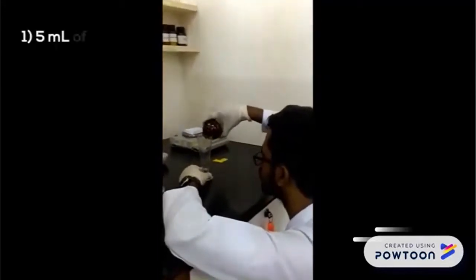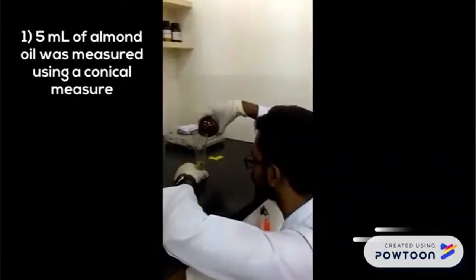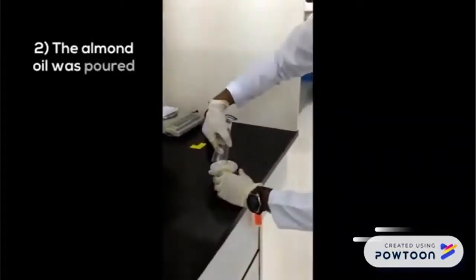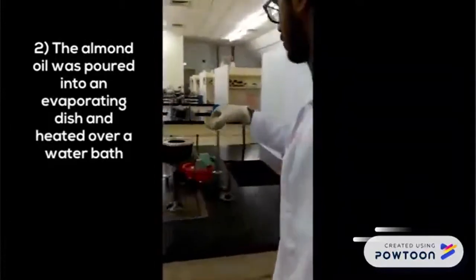Firstly, 5 ml of almond oil was measured using a conical measure. The almond oil was poured into an evaporating dish, and then it was heated over a water bath.